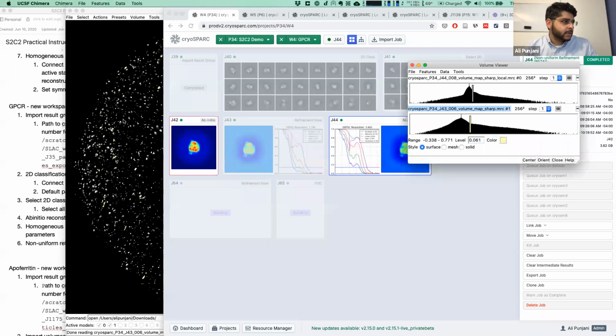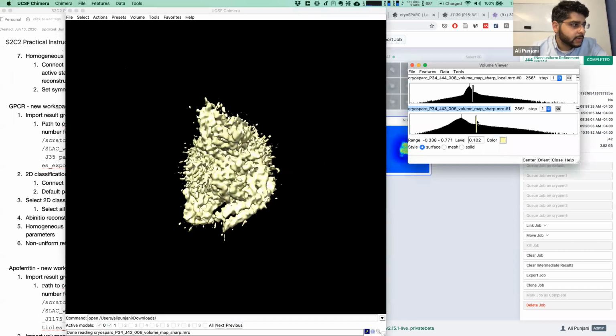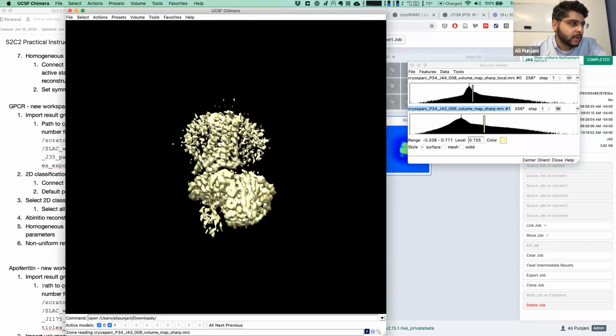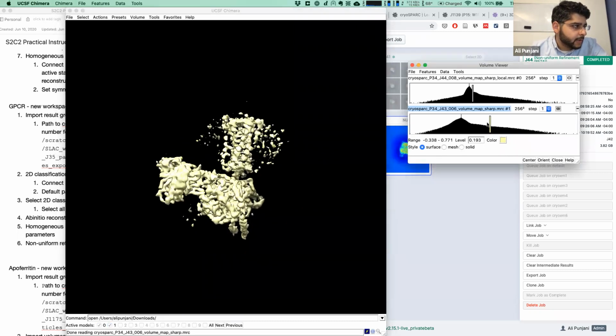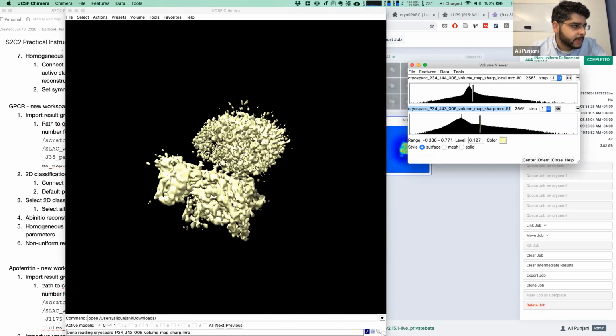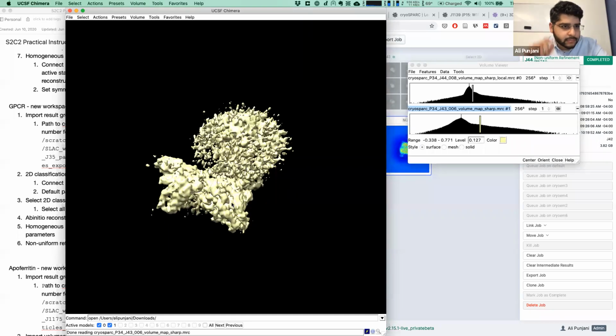Okay. So in these two reconstructions, the yellow, which I'll show first, is the uniform refinement of the structure. Again, this is with a small subset of the data, so we don't expect the refinement to be perfect anyway, but we can see that there's lots of density and structure in the micelle. It's not really ordered structure, it's all just noise.